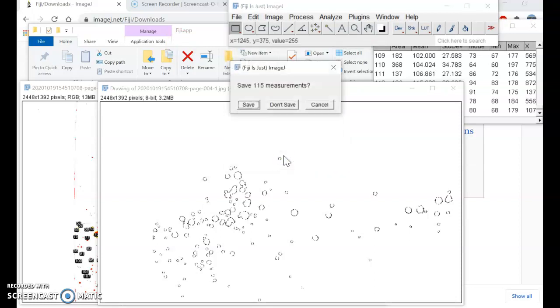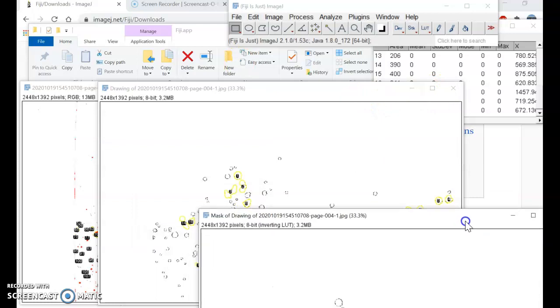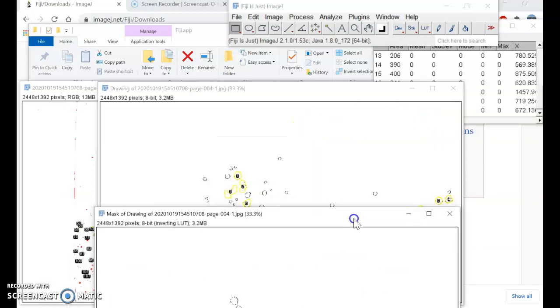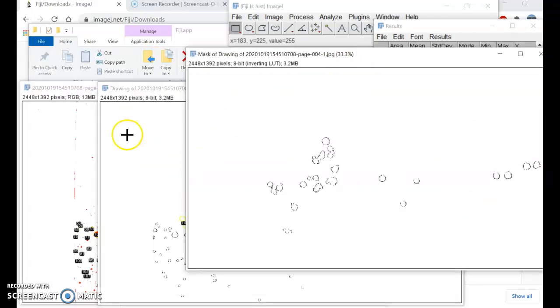Okay. Tell me where it is. But nevertheless, I think I will work on it later. But nevertheless, it gives all the areas of interest, called the region of interest, and there are only 19 areas that we are going to look at. And see, there are some irregularities because there are some spots that are merged together.